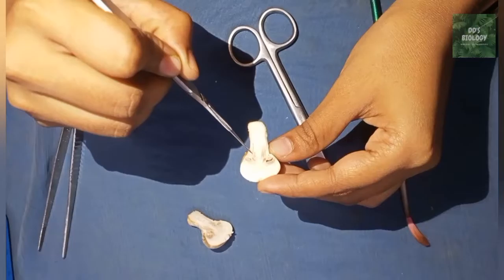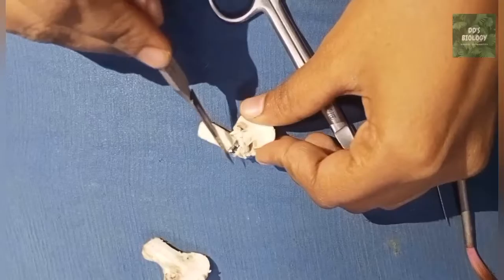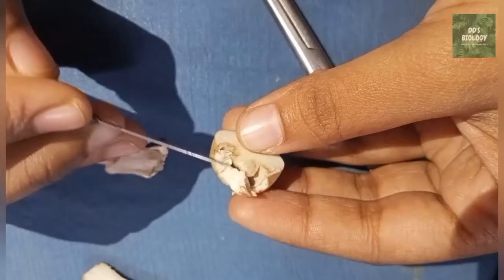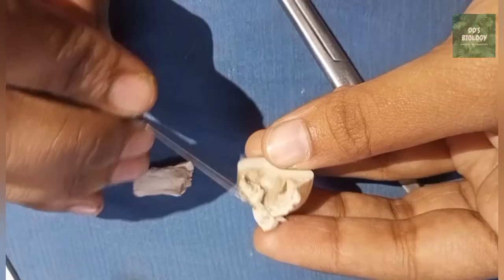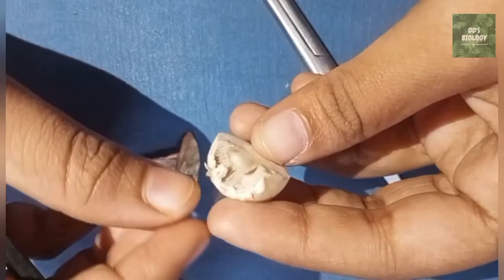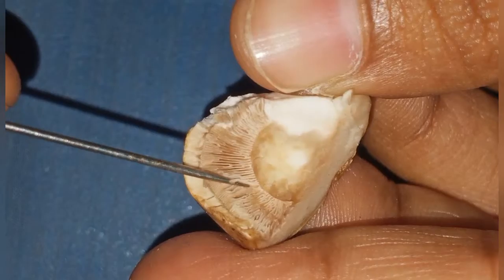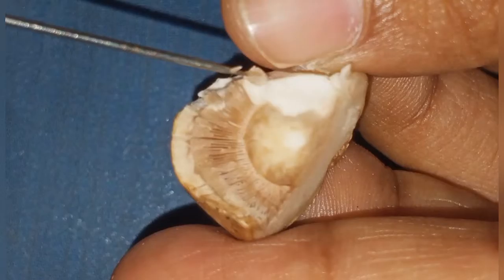These are spores. Now look at the gills — this is a compartment. The gills are in the microscope and they have spores. We are using the spores, we also use the spores.